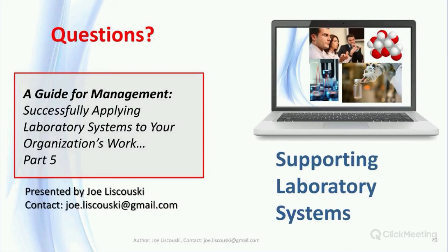Another question that came in asks, why can't we just use our IT people to troubleshoot our systems? Well, they can if the problem can be easily isolated to a computer system or application. But getting to that point is the problem. I've dealt with cases where the symptom of a problem was simply a lot of noise in the instrument signal. The evidence for the problem was a chromatographic report that had way too many peaks in it. It wasn't a software problem, but rather a loose ground wire connecting to the outlet.